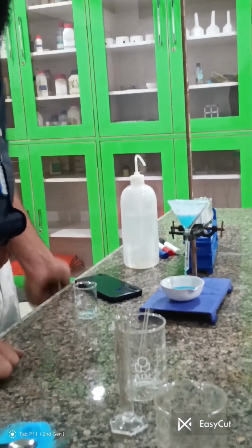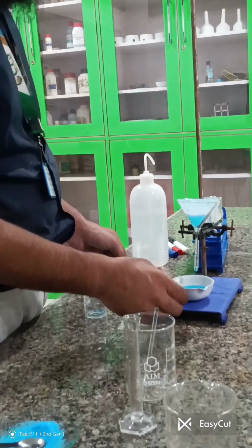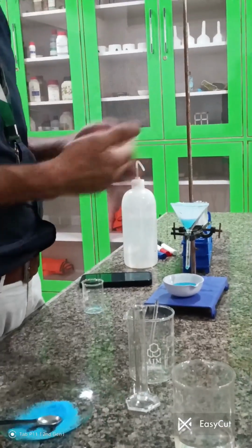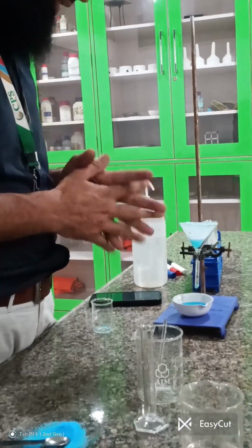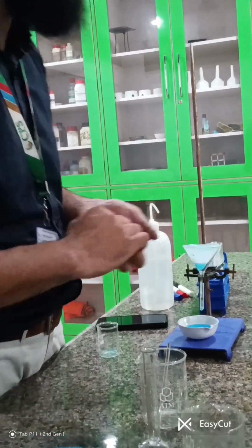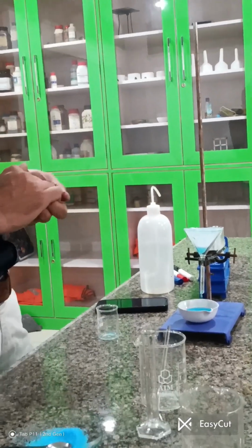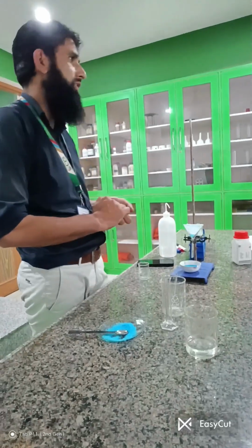Now after that, what do we have to do? We heat this solution on the burner so that it will become more concentrated. Concentrated means the water will evaporate and more solute will remain in the water. After that, when it becomes concentrated, we have to transfer it into a petri dish or watch glass, and we keep it undisturbed for at least 1 hour. And after 1 hour, you will see the beautiful crystals have appeared.